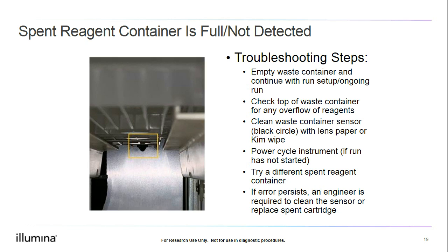If the issue persists, power cycle the instrument to reset communications. If there's another NextSeq available, you can also swap the spent reagent containers. If the issue is still not resolved, then a field service visit is required by an engineer.